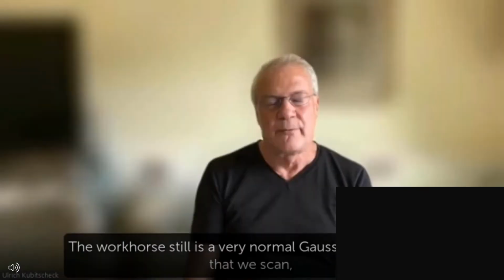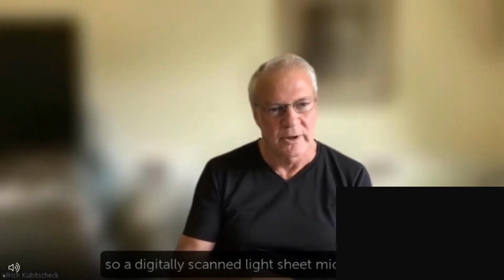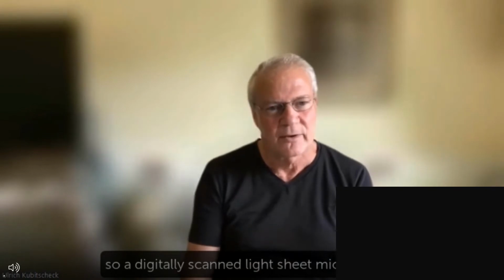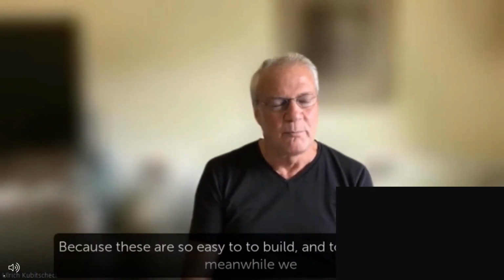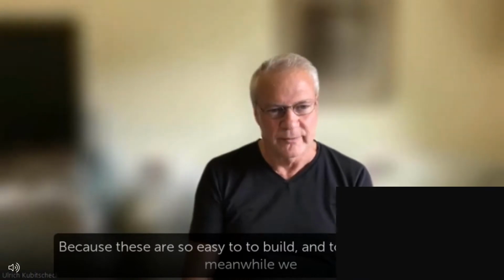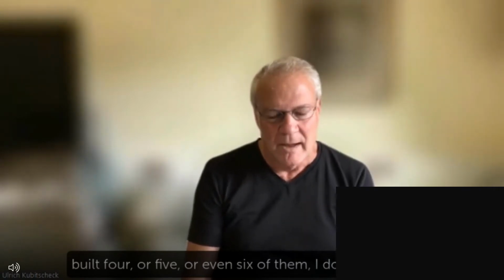The workhorse still is a very normal Gaussian illumination that we scan, so a digitally scanned light sheet microscope. And because these are so easy to build and to produce, I think meanwhile we built 4 or 5 or even 6 of them, I don't remember.